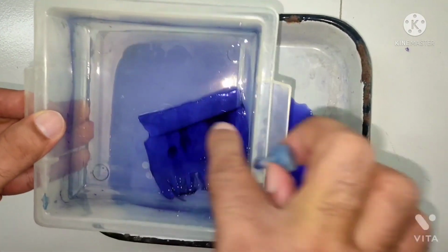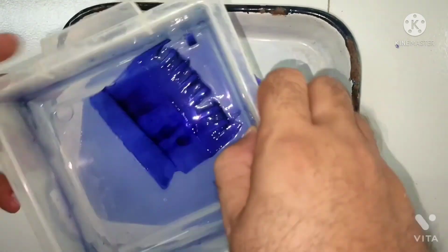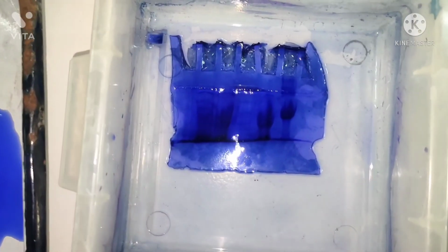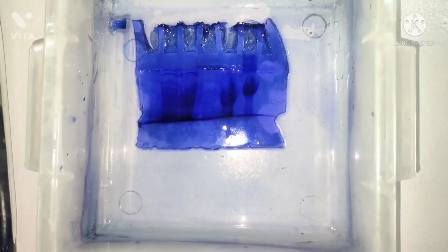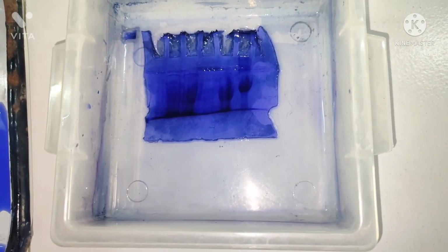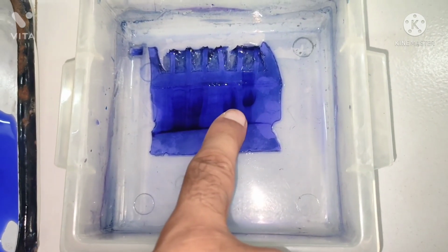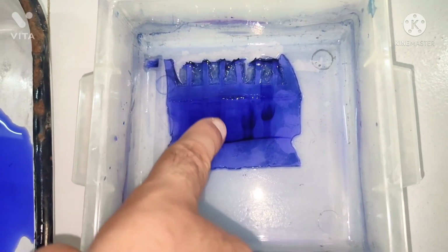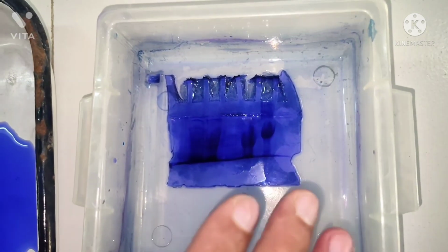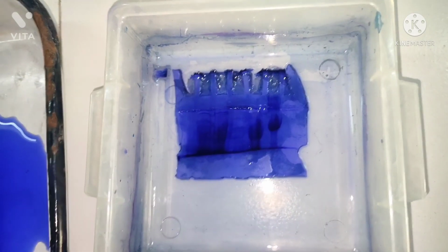So see, if I keep this gel like this, you can see the wells here. These are the different bands. Again we have to destain, at least 2 to 3 times we can destain. These dark bands, like this band, are the overexpressed protein actually, right? And here is the marker, this line is the marker. So you just do 1 or 2 more destaining, and you will get a very clear-cut gel.